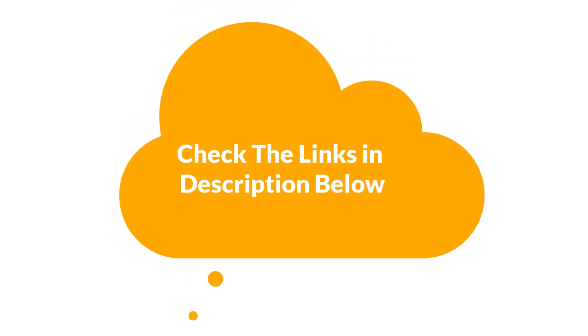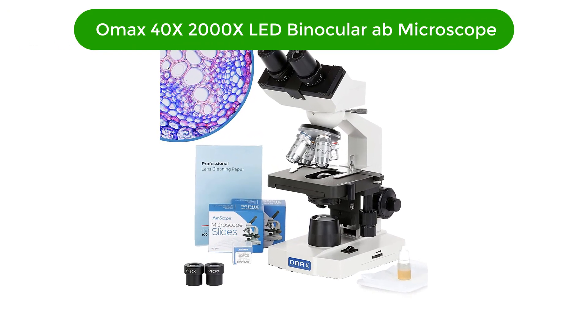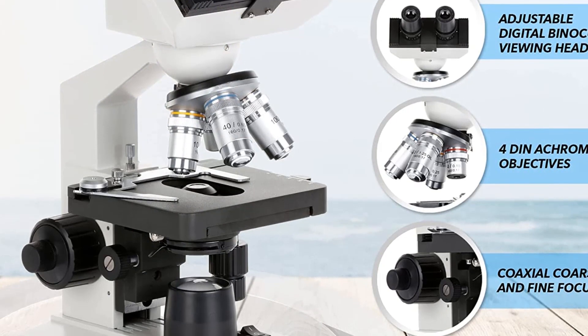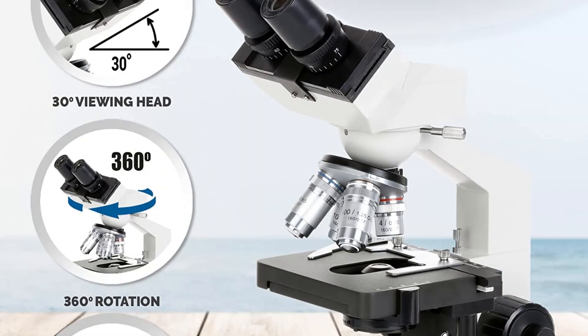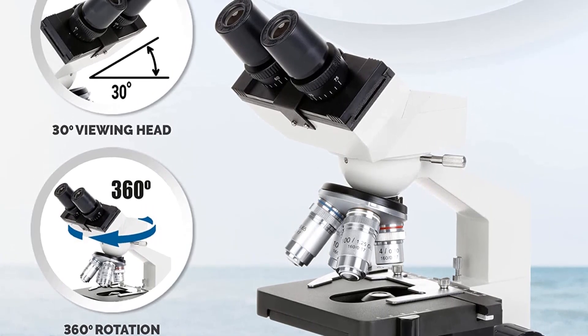Let's start. Number one, our top pick is the OMAX 40x to 2000x LED Binocular Compound Lab Microscope. This microscope is the perfect microscope for any student, teacher, or hobbyist looking to explore the world of microscopy.